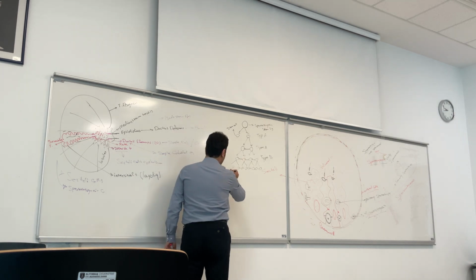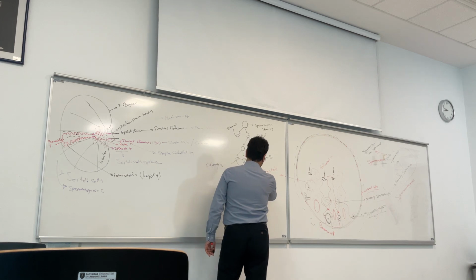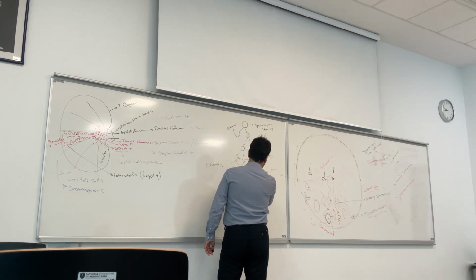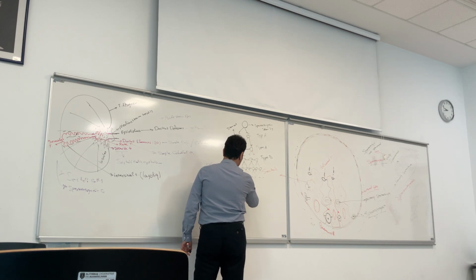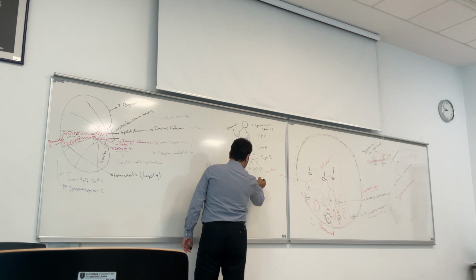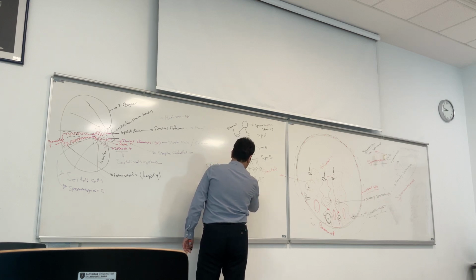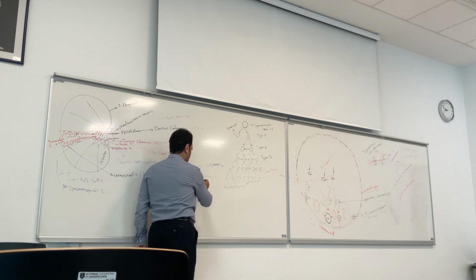These primary spermatocytes form secondary spermatocytes, which again connect with each other. And secondary spermatocytes form the spermatids. Again, these spermatids connect with each other and have cell bridges between each spermatid.